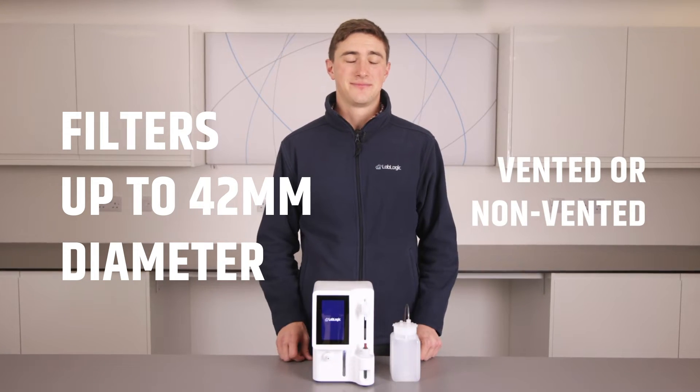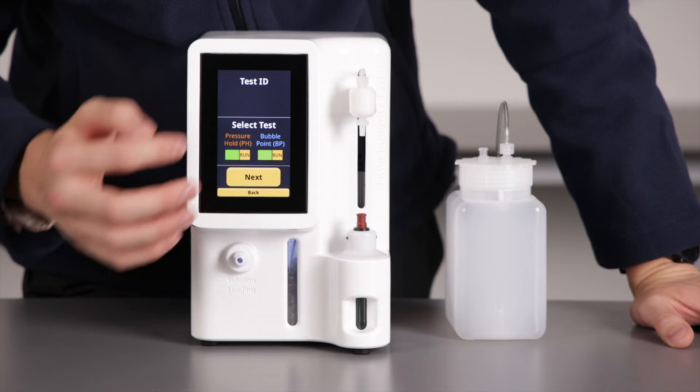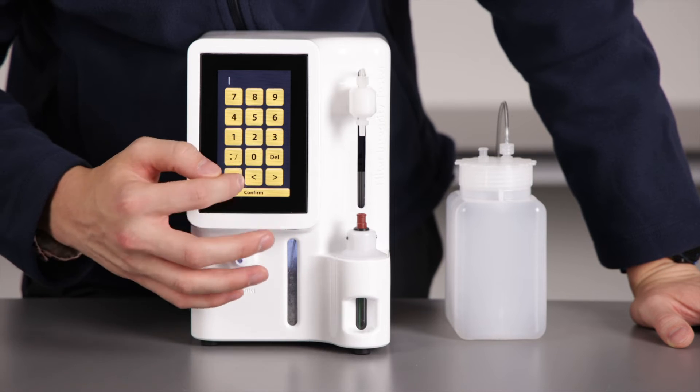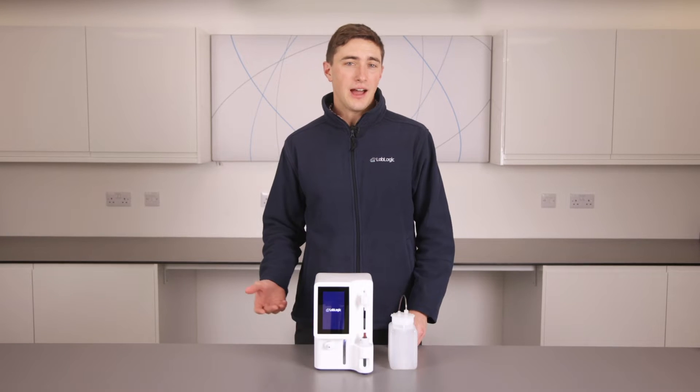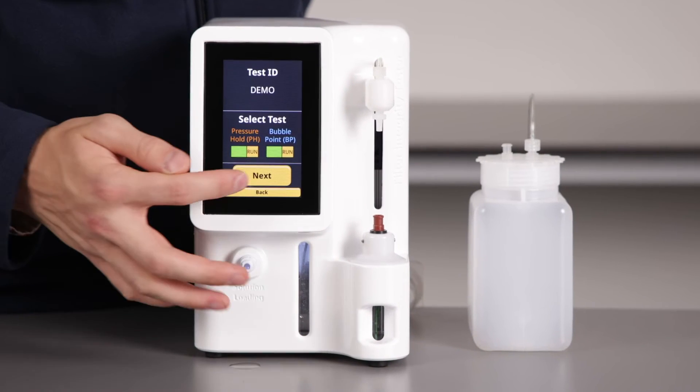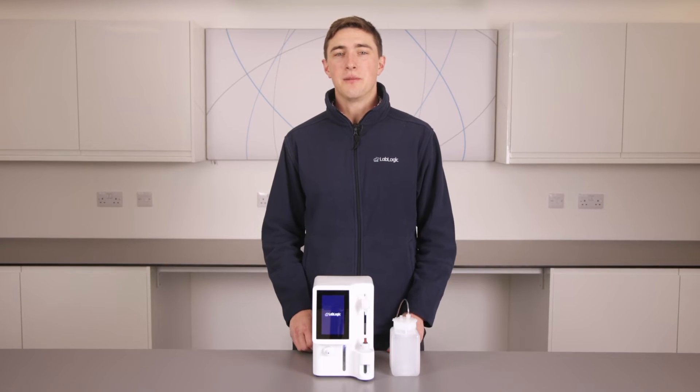Let's perform a test. First, choose start test. Next, give the test an identifier or name — I've selected "demo" for this test ID. We will decide what tests to run; I will keep both the pressure hold and the bubble point test selected. Please note, you can deselect one but not both.